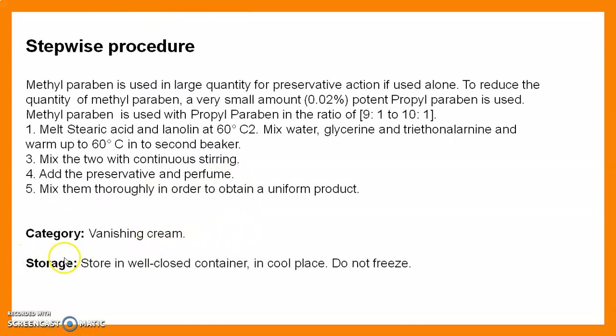The category of our preparation is vanishing cream. Storage: it should be stored in a well closed container in a cool place. Do not freeze it. Then we move toward the laboratory for the actual procedure process. Let's go.